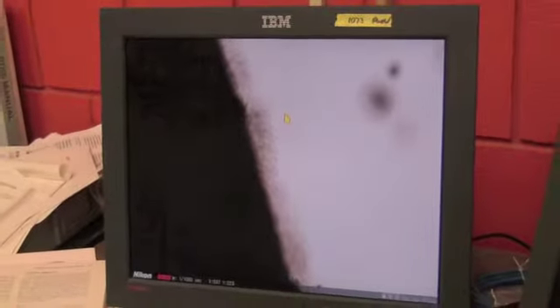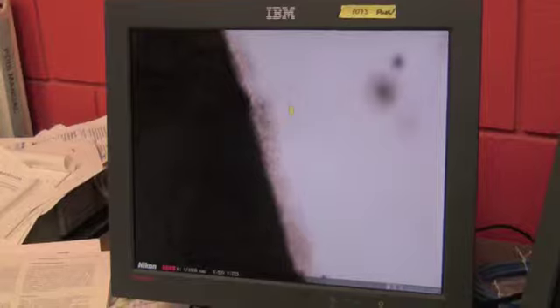So Bob, we've cut across another lesion on the leaf, and here's the edge of the leaf, and here in this kind of misty looking cloud is the bacteria that are streaming out of the leaf. We're looking at this on a computer screen, but I have it set up here on my microscope as well.